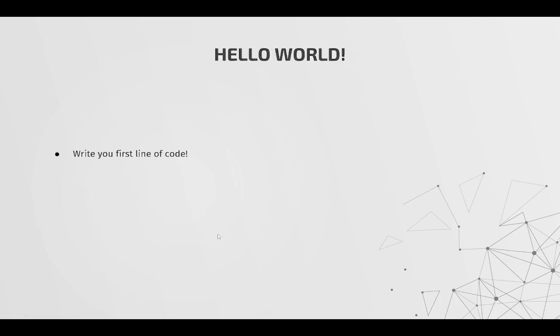So let's write our first line of code. In programming, there is a tradition that your first project is this Hello World project, which just simply prints the words Hello World. Let's see how to do that in IOLITE.